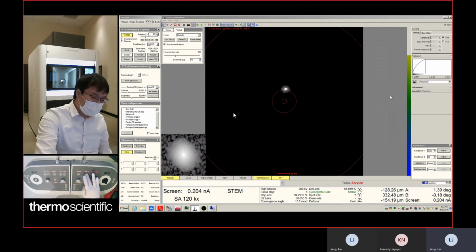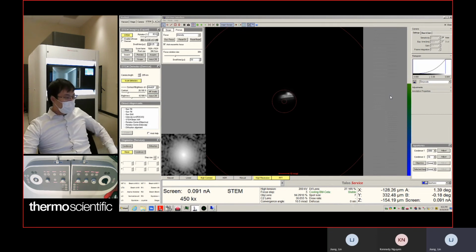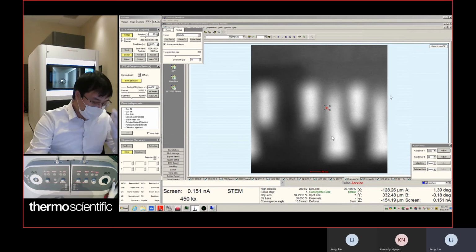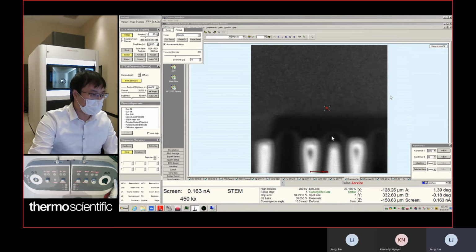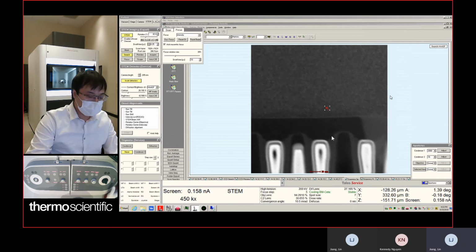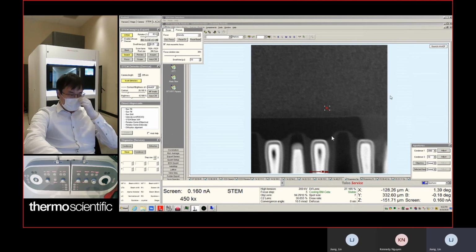After we're done with that, we can go to diffraction mode, and then take a look at the image by looking at the sample. You can go search. Because we touched the intensity focus, we reset the intensity, you reset your center focus, and your sample is out of focus. You need to bring your sample back to focus, but you use Z height. Okay. In this case, you don't use the focus knob to put your sample in focus. Don't use too much of your focus knob to focus your sample, because when you touch the focus knob, you basically change the size of your probe.